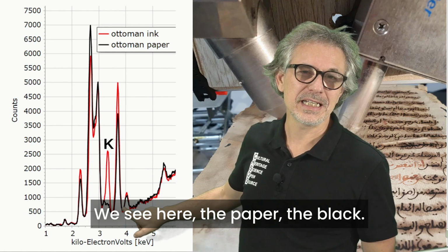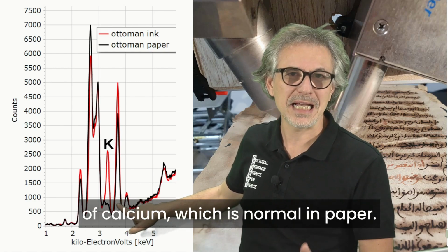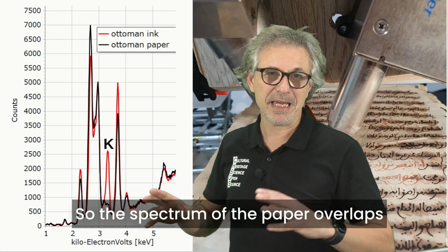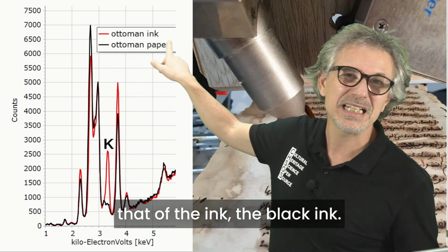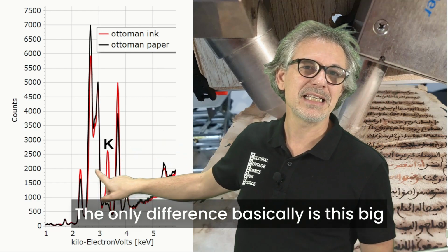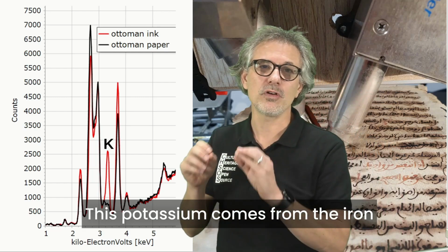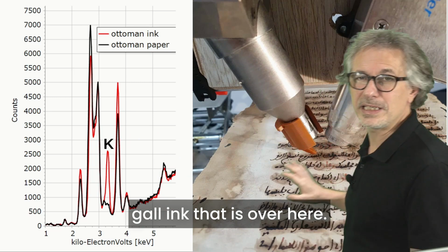We see here the paper, for example here we have the peak of calcium, which is normal in paper. The peaks basically overlap, so the spectrum of the paper overlaps that of the black ink. The only difference basically is this big peak over here, which is potassium. This potassium comes from the iron gall ink that is over here.